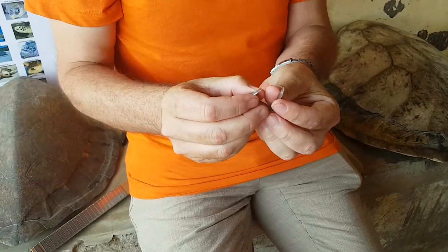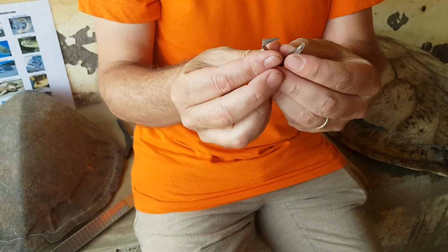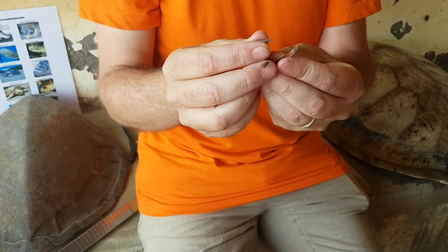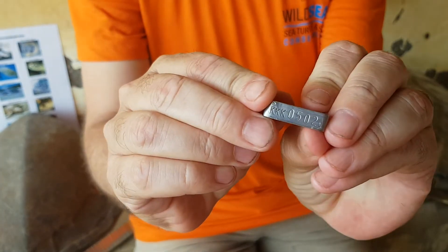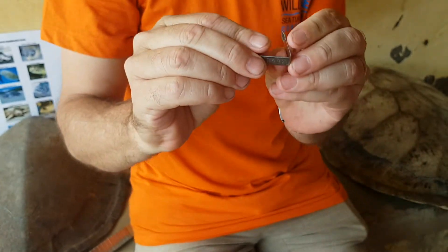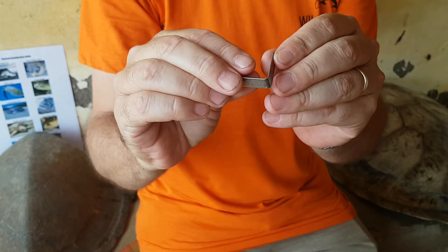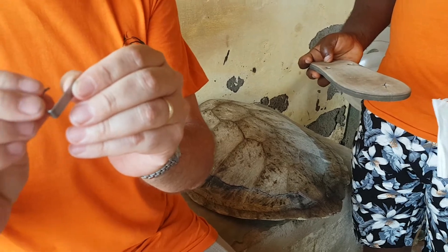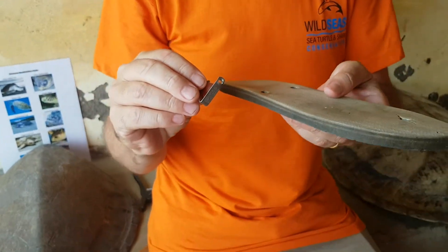The next job is to take the actual flipper of the turtle. We would normally tag between the first and the second scale at the trailing end of the front flippers, and each tag has an individual number which needs to be noted down. For the purposes of this exercise we're going to use an old flip-flop slipper that has a reasonably similar consistency to an actual Sea Turtle flipper.